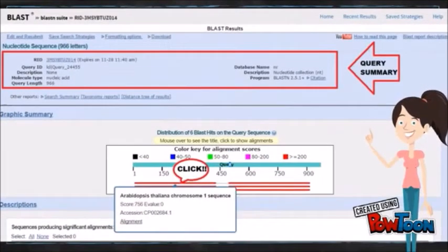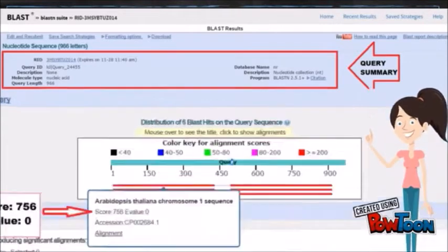The result shown here is a summary that displays the length of your sequence, the database name and other descriptions. And by clicking on the thin red line, the name of the species, score value and e-value are presented.